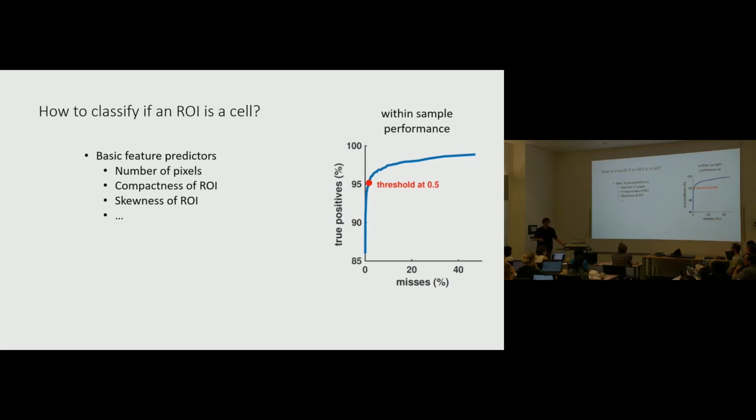So depending on exactly how strict you have to be in your criteria for accepting ROIs, you can go from taking all of the ROIs, because you've already looked at a few data sets, you're happy with its performance, and from now on you're happy to trust it, or you have to do maybe a lot of manual curation. Maybe you don't have that many cells, but they're really important cells because it's a very precise cell type and they're very sparse and it's during your behavioral session and you really have to get every single cell. So there's a spectrum between these two scenarios that we try to capture. We try to give you enough options to deal with both extremes. And I think you guys represent a good part of that spectrum, so we'll hopefully be able to refine how well we cover the different situations.